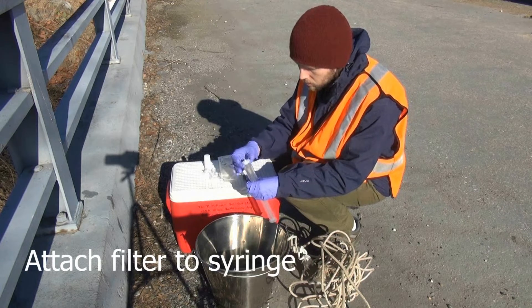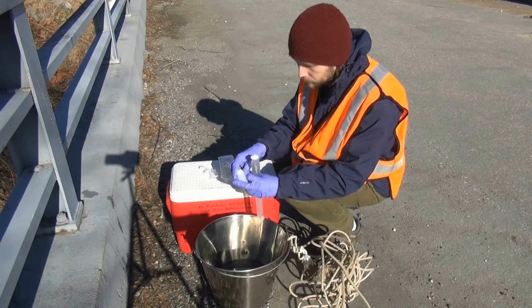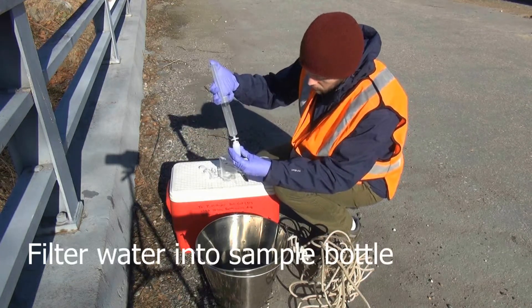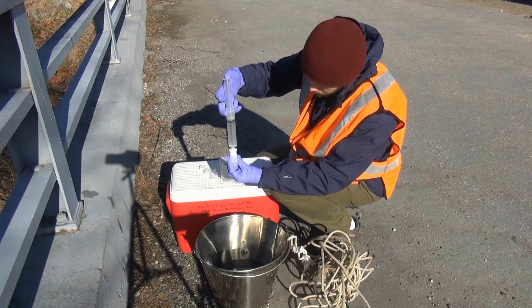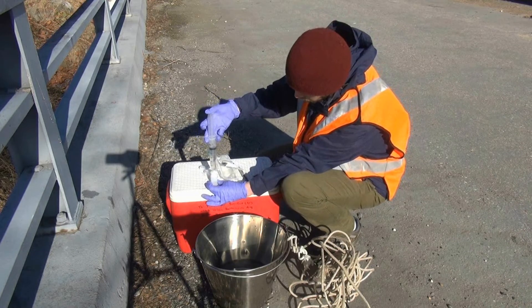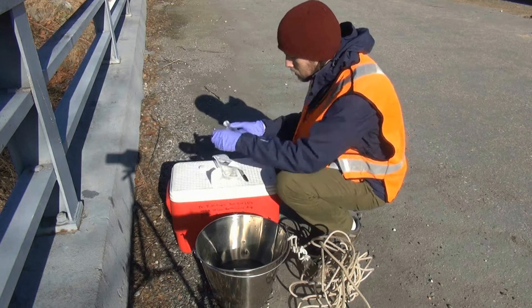Unwrap a filter and attach it to the head of the full syringe. Let a few drops out before filling the sample bottle. You may need to use multiple filters.